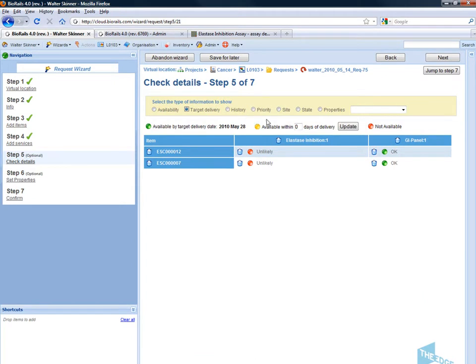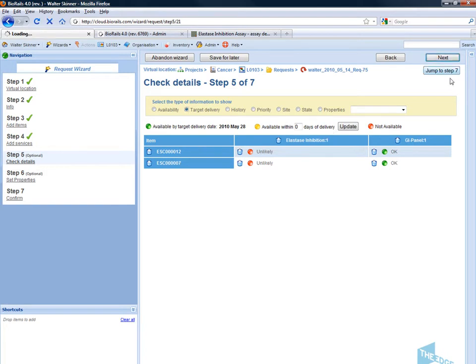Also allow me to reorganize the priorities, tell me if it was having to be transferred from different sites and also manage any other properties that come with the request.